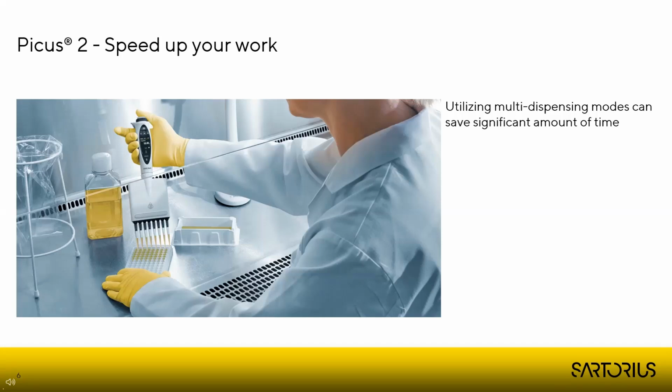Multi-dispensing uses the reverse pipetting principle to aspirate multiple doses of the selected volume, which it repeatedly dispenses when you click the button. For the most precise results in this mode, we have the prime excess, which is discarded before the first dose, and after the final dose, we have excess liquid. Those two together make sure that the first and the last aliquot are equal to the middle aliquots. Multi-dispensing requires some excess solution to be prepared, so be mindful, especially when using multi-channel pipettes where you have 8 or 12 or a number of channels aspirating at the same time. So consider that when preparing the solution.